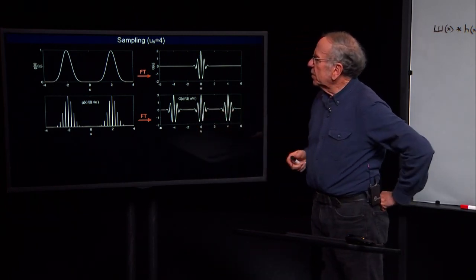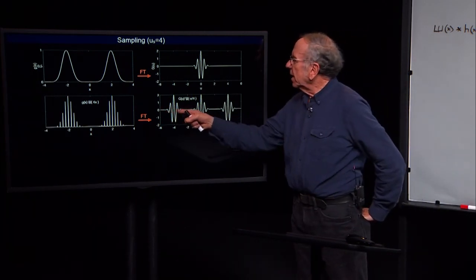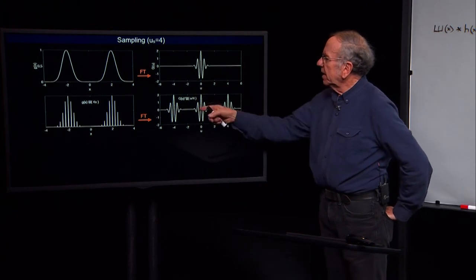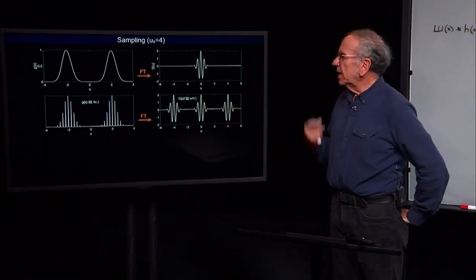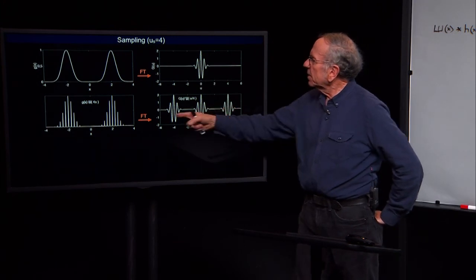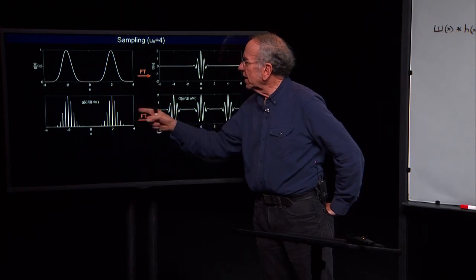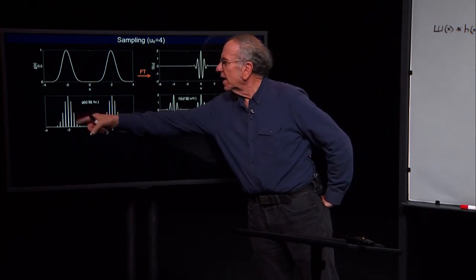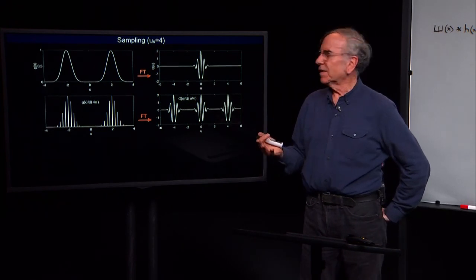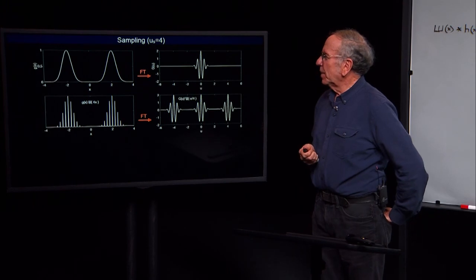So this should look to you a whole lot like a crystal. This is an infinite repeating lattice, and at each lattice point there is some kind of density. If we Fourier transform this repeating lattice in the other direction, we get a bunch of delta functions that are kind of like 1D spots, and so we're actually doing crystallography in one dimension.